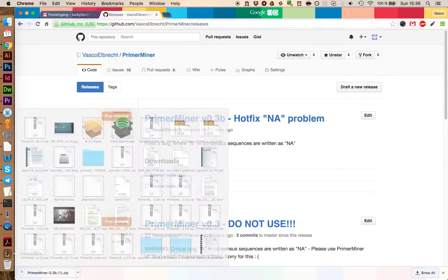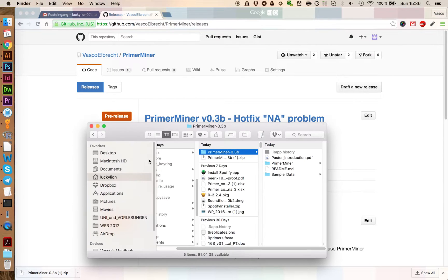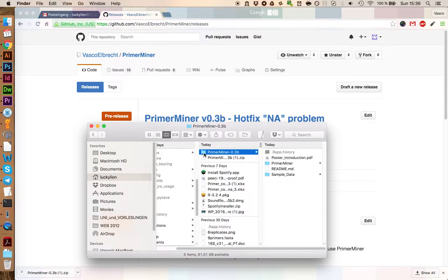Next you have to unzip this file here and we move the folder onto the desktop.